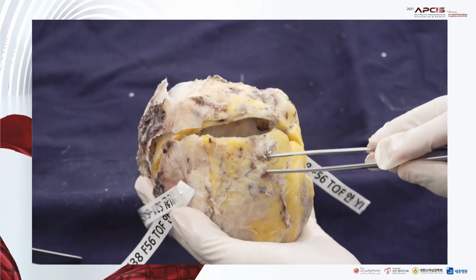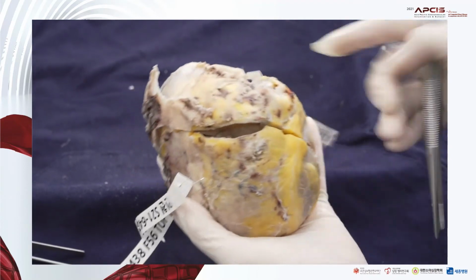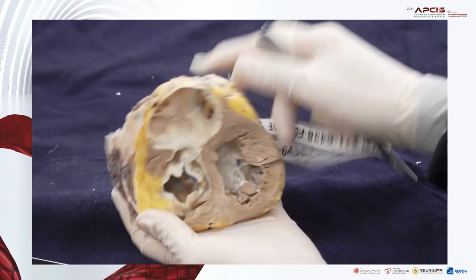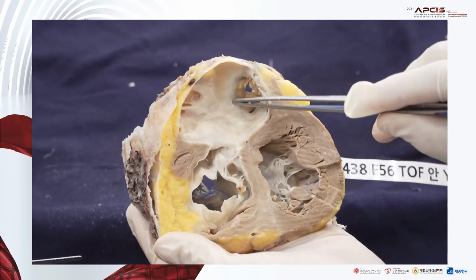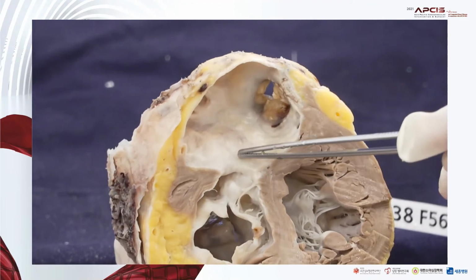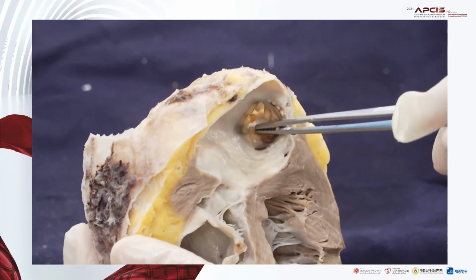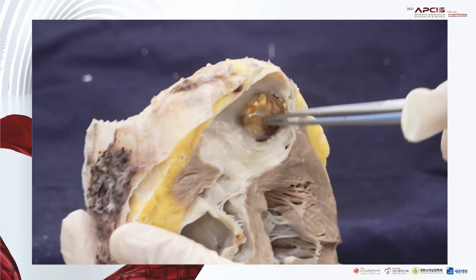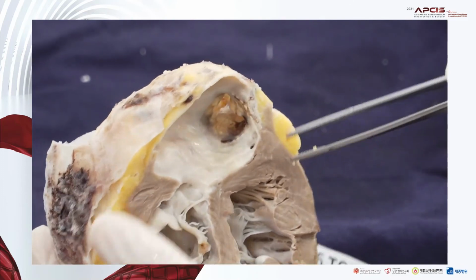Also in this case, the right ventricle from outside is dilated and the left ventricle is not very much dilated. By sectioning this heart, we can see a diverticular anterior extension of the right ventricle, and this part represents some right ventricular failure. The pulmonary valve is also dystrophic, so it has some problem, but it's not very significant in this condition.